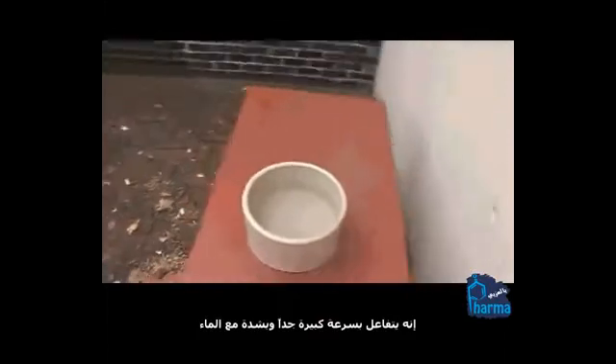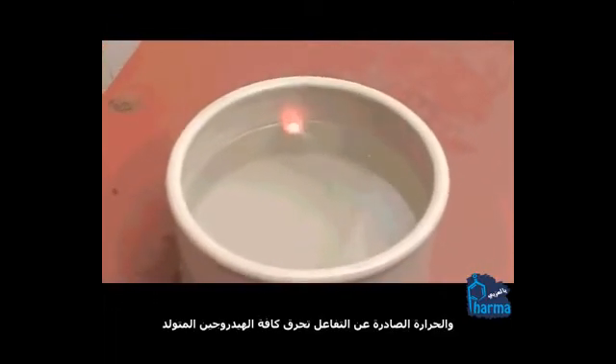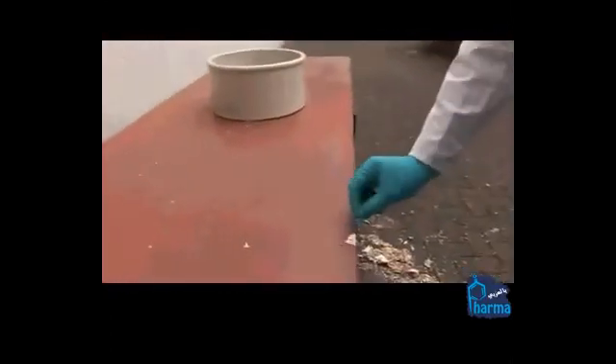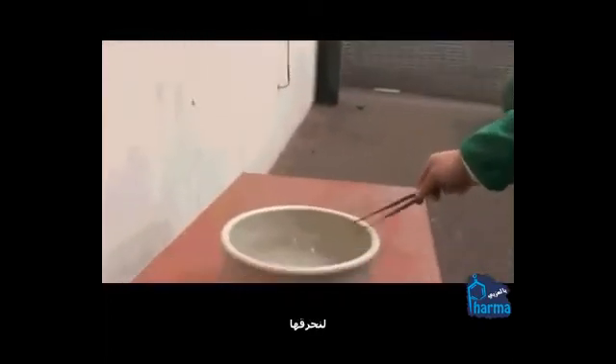It's reacting really quite quickly and violently with the water. You can see it's fizzing around as it's generating lots and lots of hydrogen gas. The heat from the reaction is burning away all of that hydrogen which is being generated, and you can see the orange sodium flame. That's a great chunk of molten sodium that has come out of there.